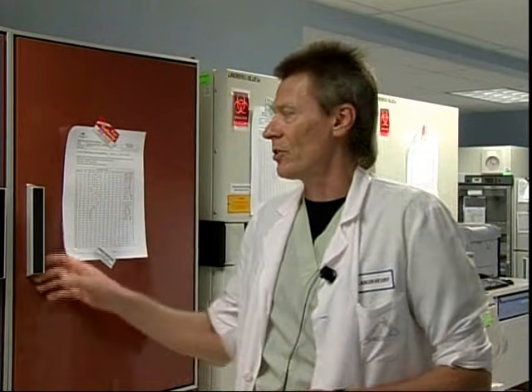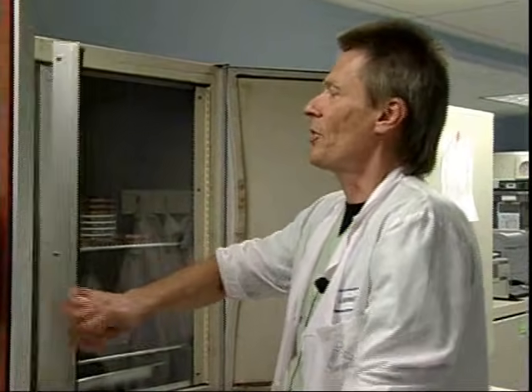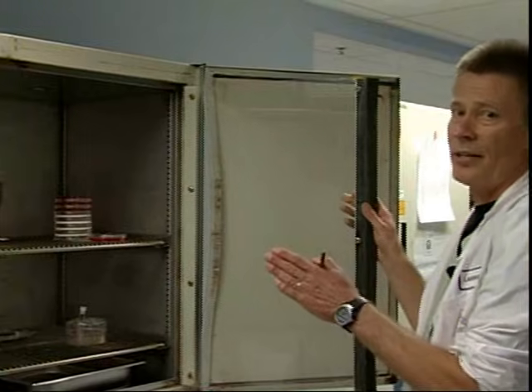The third requirement of bacteria is to provide them with the proper temperature. By far, most bacteria grow at body temperature. That ranges between 35 and 37 degrees. This is a 37-degree incubator. We monitor the temperature with a thermometer to make sure it's always maintained at 37. And most bacteria grow at body temperature.